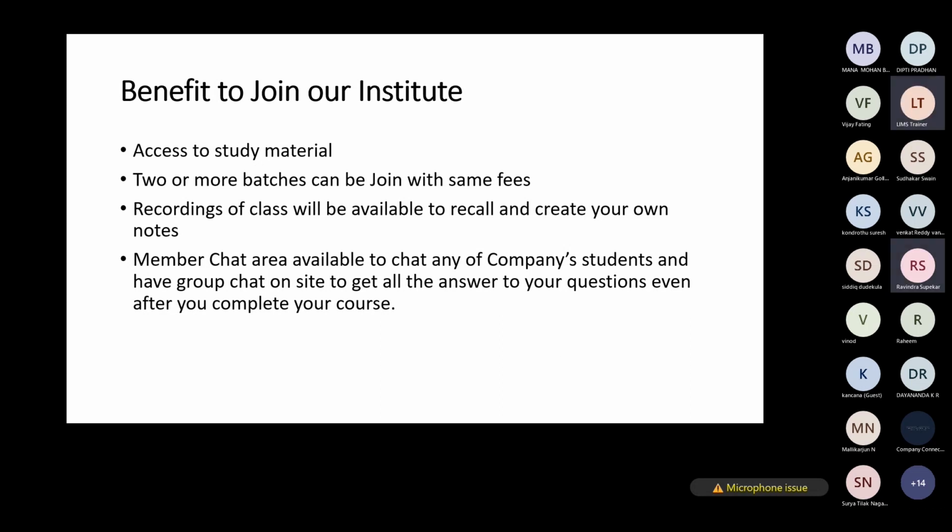Will you give only PPT-based training, or will you log into the software and show a demonstration regarding master data creation? Logging into the software and showing a demonstration is very tough. Only the pharma companies which have access can show you that direct demonstration, because they have access to LabWare LIMS.